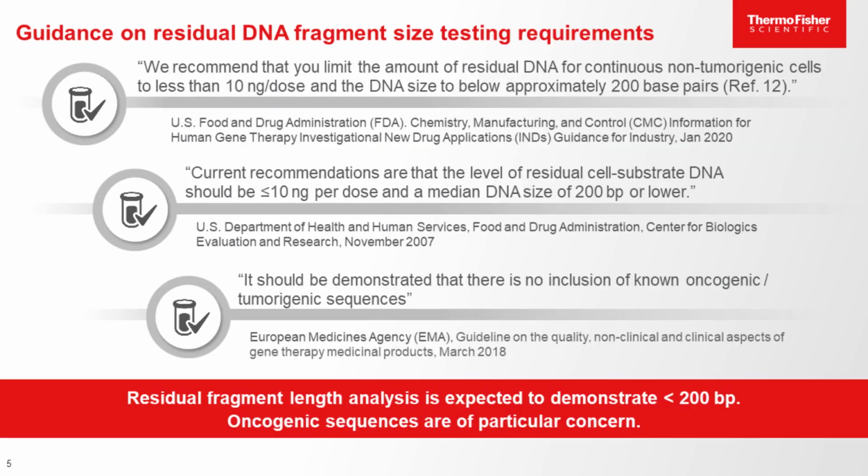So a little bit of statements from regulatory guidances here around residual DNA testing. The FDA, first of all, specifically calls out a 200 base pair limit, right? Therefore, expecting a robust validated method to analyze the residual DNA.